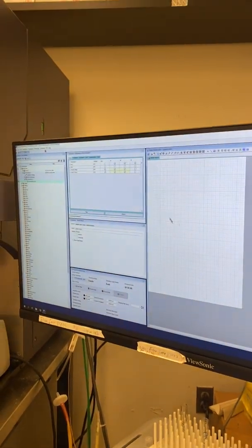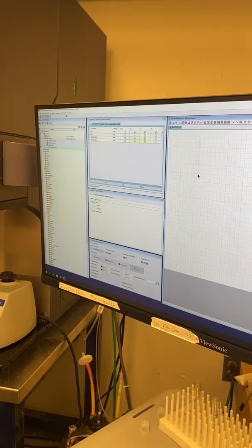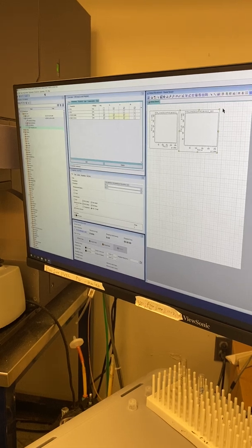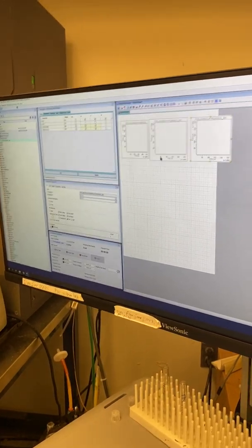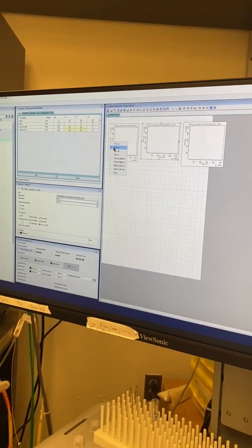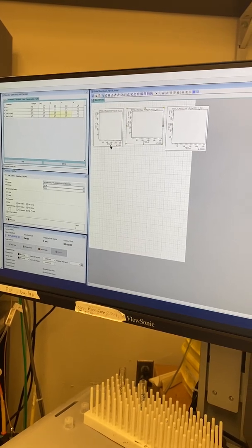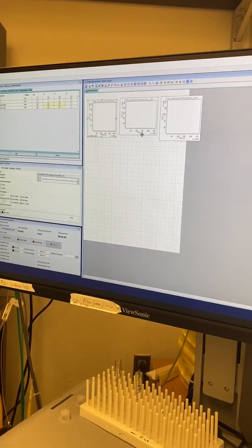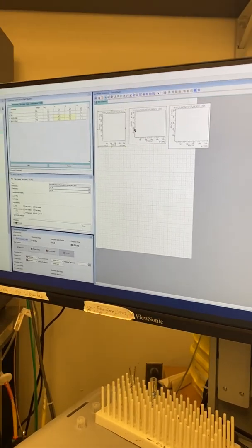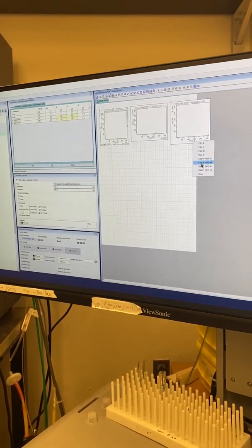So going back to the protocol of interest, I'm going to draw 3 plots right away, because this is the way that we traditionally do things. I'm going to make a forward scatter by side scatter plot, and then you can change the parameter on the center of each axis. Then I'm going to change the second plot to forward scatter width by forward scatter height. These are the doublets. And well, I'm going to do side scatter width.